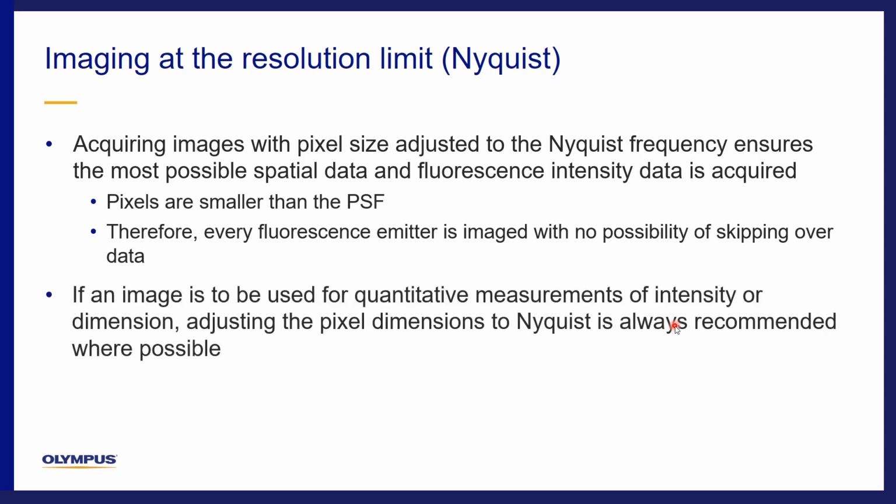So along the same line, if you want to use your image for measuring intensity or for measuring colocalization or for measuring distances, etc., Nyquist is always best because that's going to give you the most possible spatial and intensity data from which you can then measure.